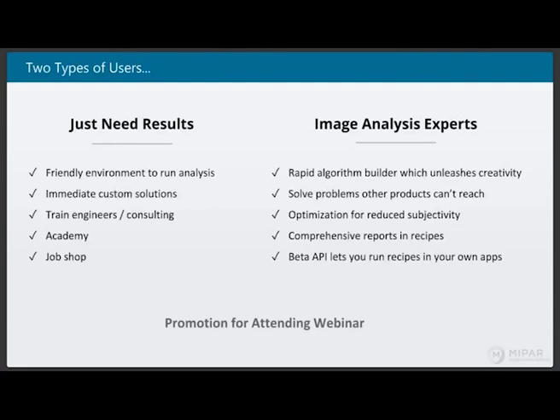And then we also do job shop work. If you are one that doesn't even want to worry about software, you just want to send us images and get reports, we do have that service available.